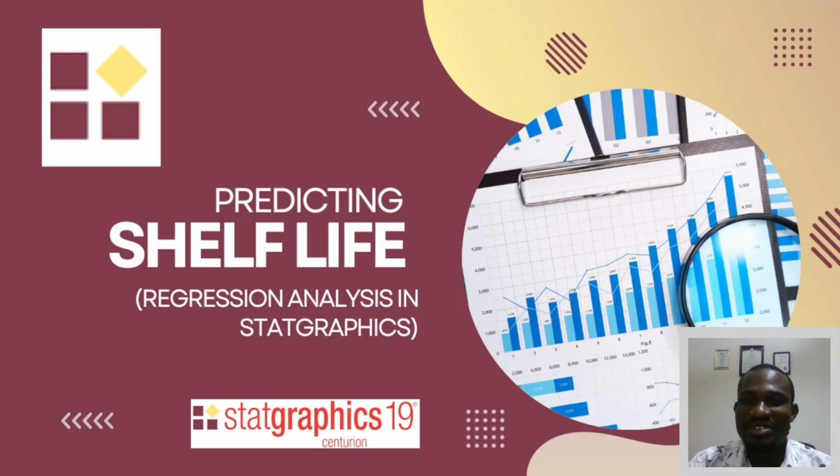The model that gives you the best R squared, and then you try and plot your own graph with the application and develop the equation, find the equation on the graph, and with your own mathematics, you compute what your shelf life will be. Now, with Statgraphics, you can put in your data, it will do the analysis for you and get you an estimate of your shelf life. So let's do this in Statgraphics.